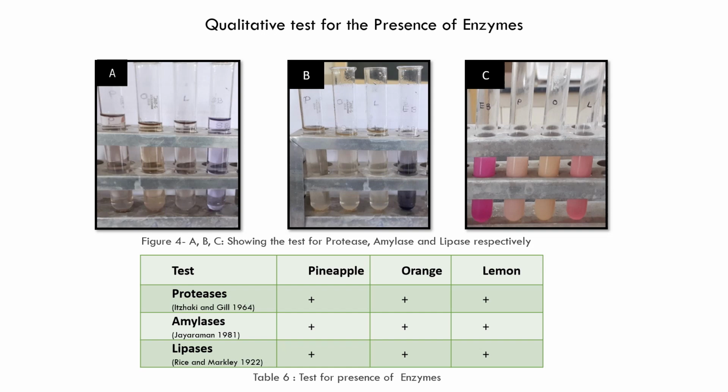pineapple and orange and lemon bioenzyme had broken down the fat present in the milk into fatty acid, thereby reducing the pH. Hence, you can see that the color is fading from pink to light pink and eventually white, thereby indicating the presence of lipase.